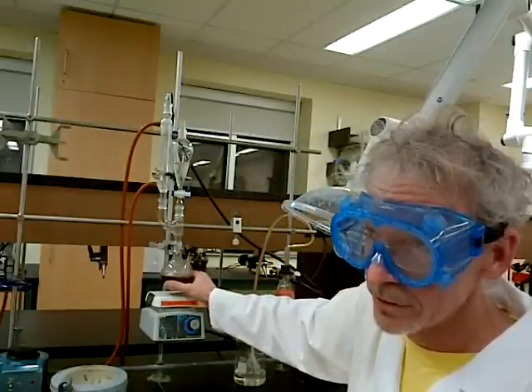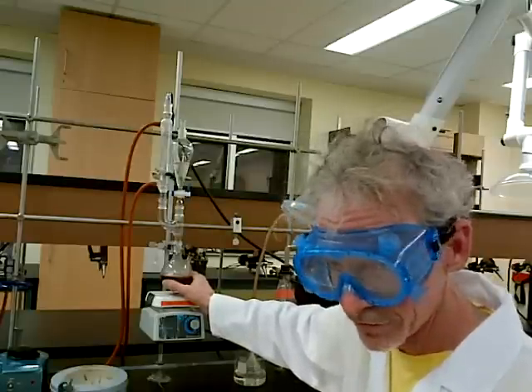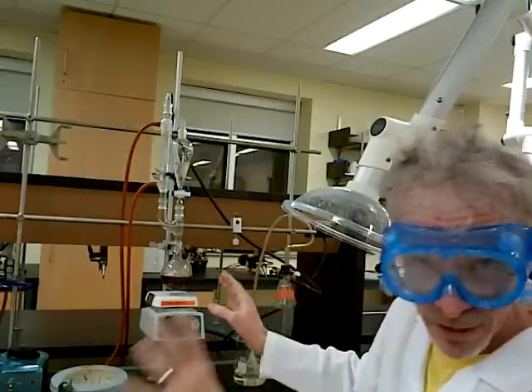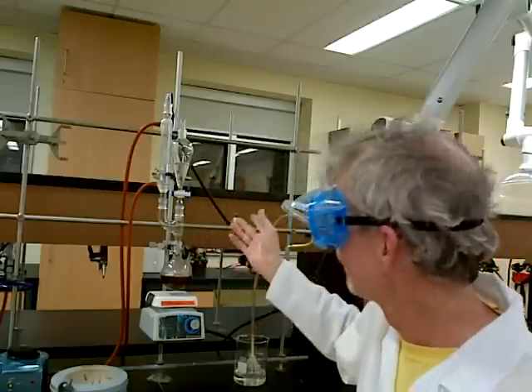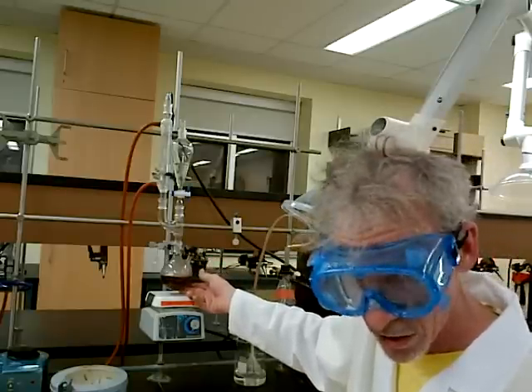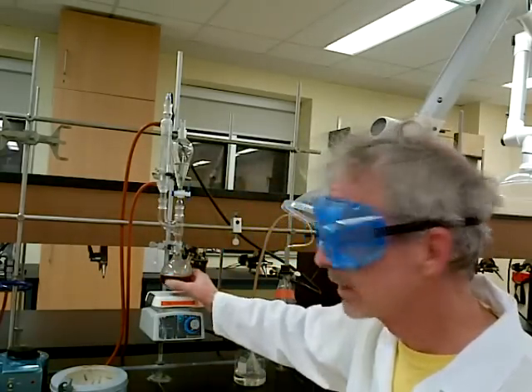Normally one would do the reverse addition, adding things like water in a different fashion. However, in this case, in order for the chemistry to go properly, we have the chloride and bromide in place with the alcohol, and we want to substitute the alcohol group with either chloride or bromide. Unfortunately, hydroxide is a really lousy leaving group, but water is a better one. So we can protonate the alcohol using the really strong sulfuric acid — that essentially catalyzes the reaction — allowing chloride and bromide to displace the alcohol. So we will get our products of chlorobutane and bromobutane.